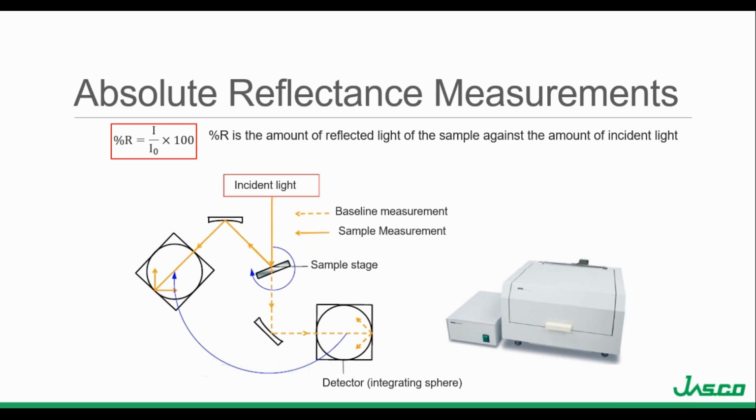A mirror in the sphere, which also houses the detector, is then rotating relative to the sample stage to achieve the specified detector angle. The reference measurements are performed using a fiber optic cable, which brings the light source out into the sample's accessory or the accessory sample compartment in order to ratio the sample to reference beam.